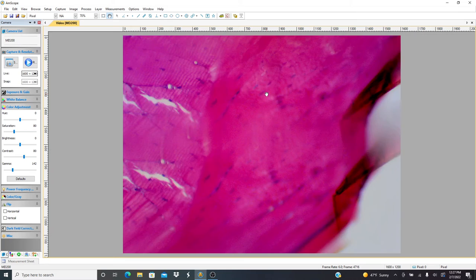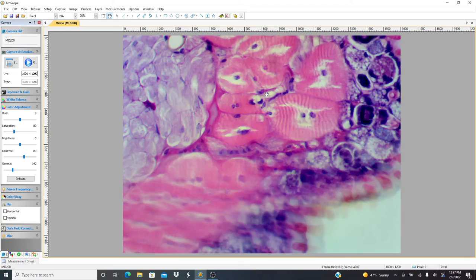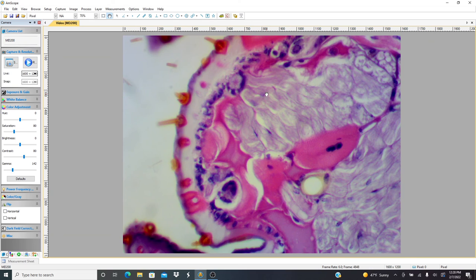Very interesting. Let's look at the leg one more time, this cross section of this leg. Look at those spikes. Yeah, this is pretty cool. All right. I think I'm gonna do the slugs next.